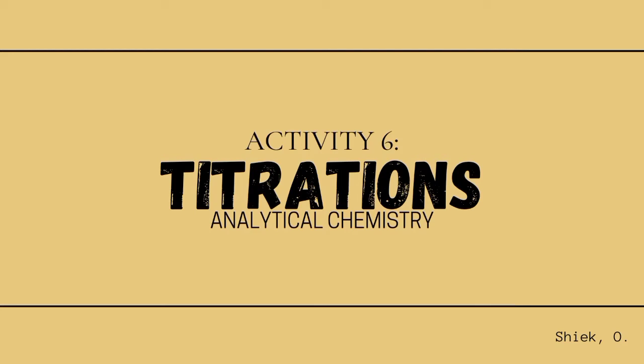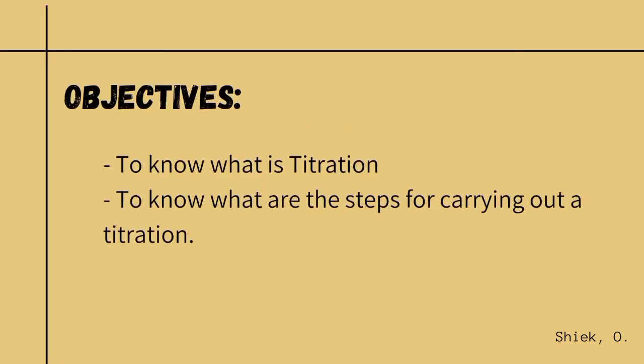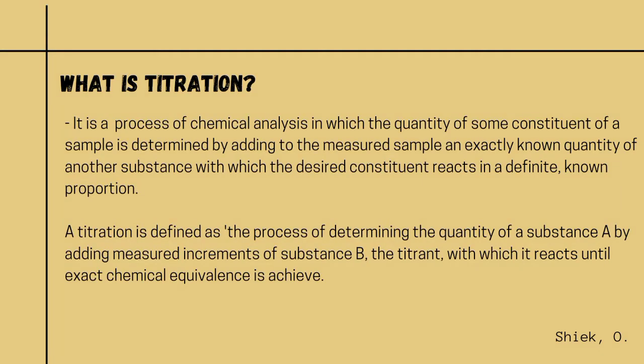My name is SHIEK, and for this video, I'll be presenting my output in Activity 6 entitled Titrations. So without further ado, let's begin. My objective in this video is to know what titration is and what the steps are for carrying out the titration. So what is titration?